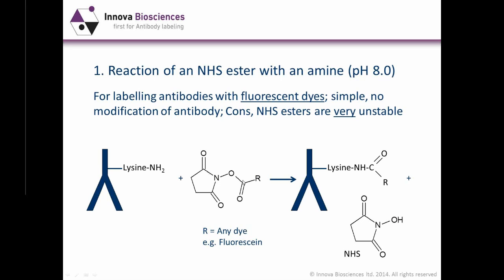And effectively, the amine reacts with this molecule. The NHS is pushed out, and the dye becomes attached to the lysine through an irreversible bond. So probably 80% of bioconjugation reactions involve this sort of chemistry, and the only thing that differs is what you have here.